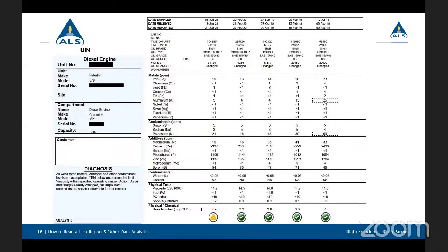I know it sounds a little counterintuitive, but think about somebody who's operating diesel engines and trying to maximize their oil intervals, and sometimes those can go past the recommended interval depending on how those trucks are driven and what type of environment they're in. If you've got a really good oil, you can actually extend those drain intervals out. So what you've got here is an oil that you've taken right to the limit of what we would consider normal.